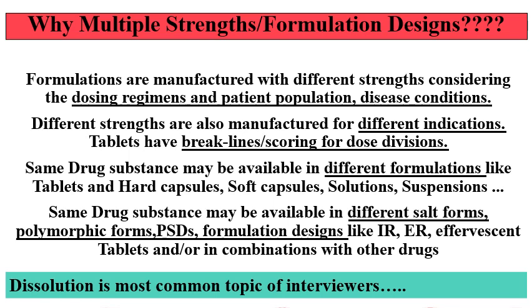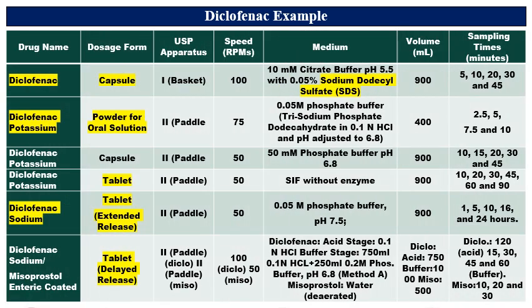See here, I am taking an example of diclofenac. Diclofenac sodium is available. Diclofenac potassium is available. The plain diclofenac base is also available, and it is available in multiple formulations. Here I have listed some of the formulations.